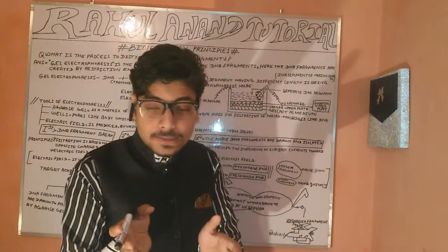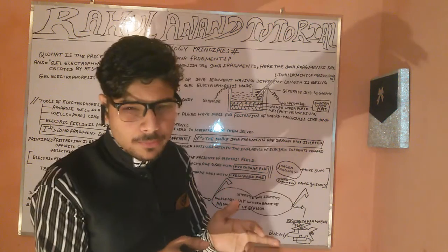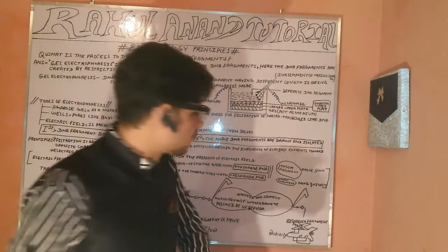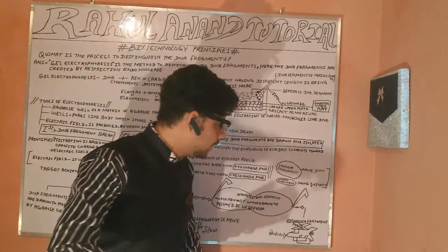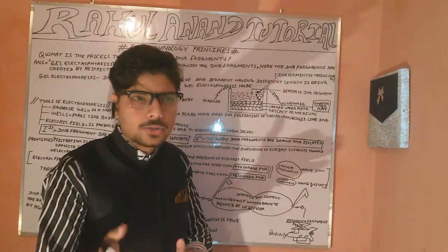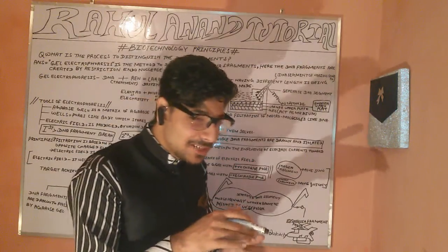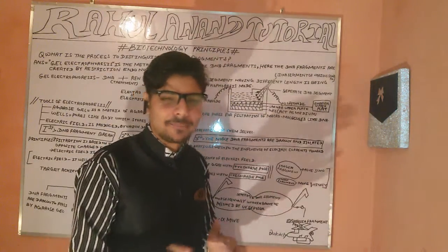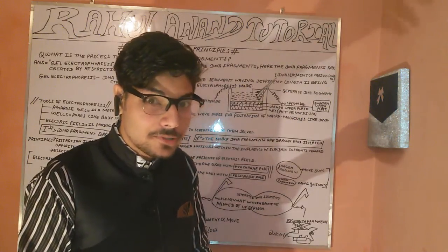So primarily it will be breakdown, then the separation process, then the segregation process, as you could find here on the board. So the novel DNA fragment will be primarily isolated as well as drawn. Isolated means it will be separated. So separated, of course.